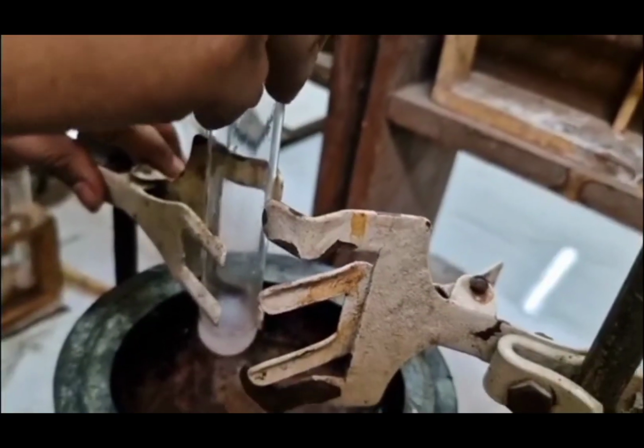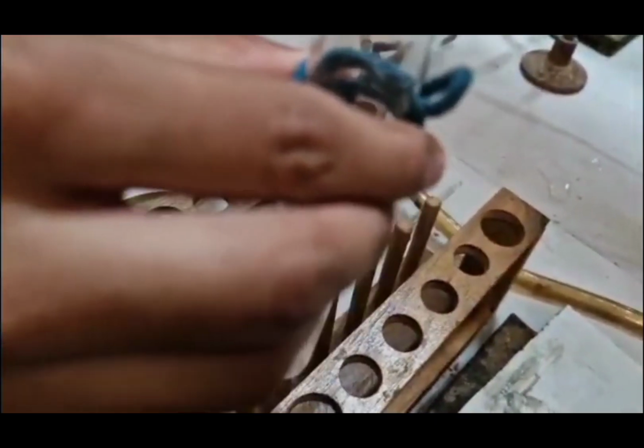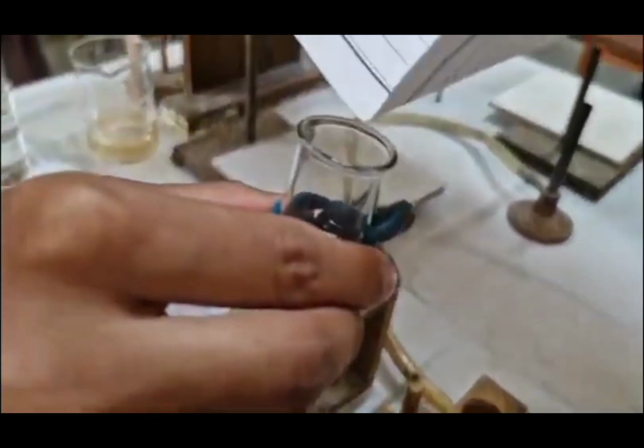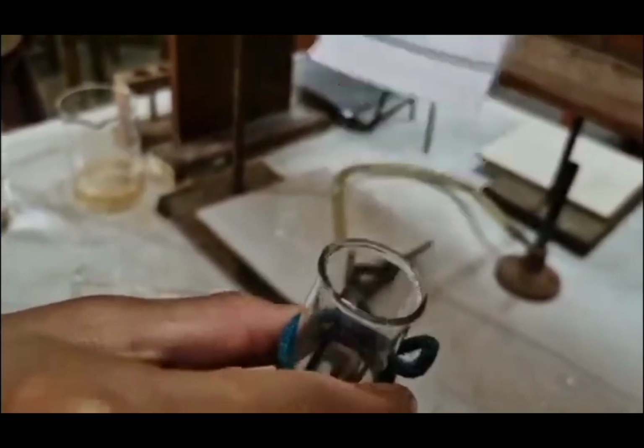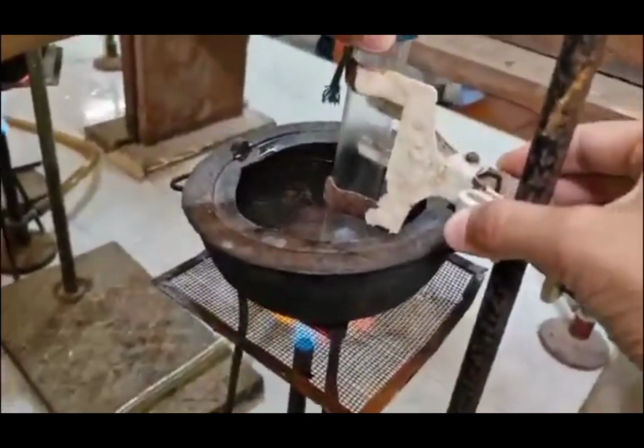Mix both. Heat it until the turbidity disappears. Now we will take 2 ml water and 2 gram phenol in another test tube, mix it, and add 0.2 gram NaCl in it and mix well. Similarly, we will heat it until the turbidity disappears.